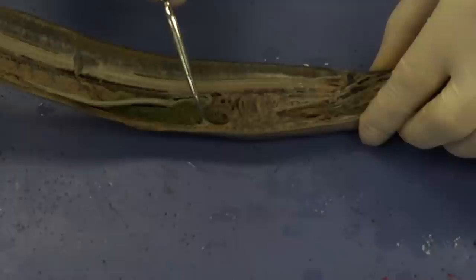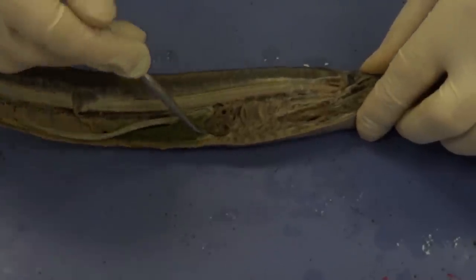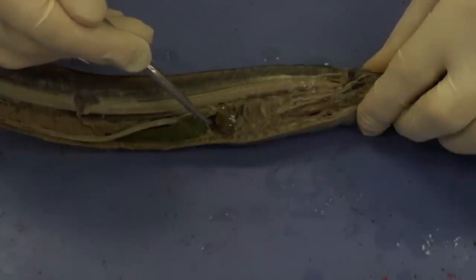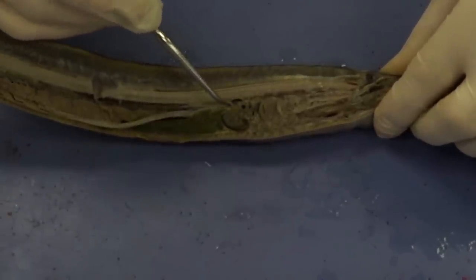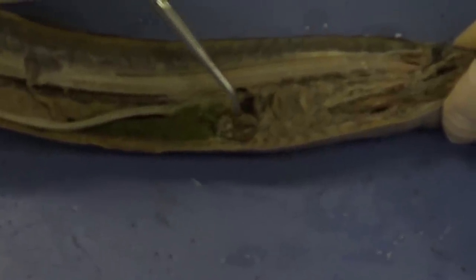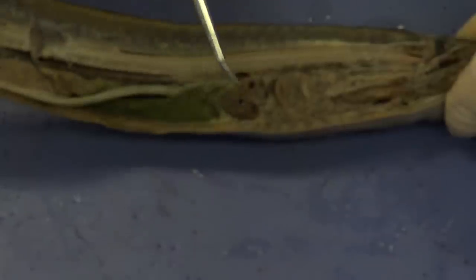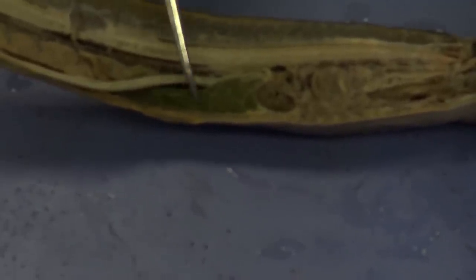Posterior to the gills is this structure — you can see it's a very muscular structure. That is the heart, the lamprey's heart right there. Then posterior to the heart, we have this green organ, which is the liver. And dorsally, you can see the intestine again.